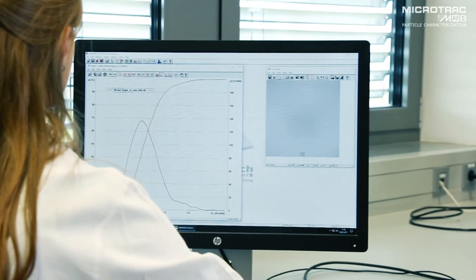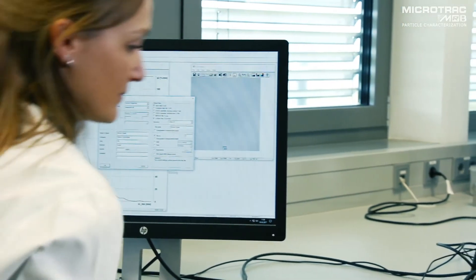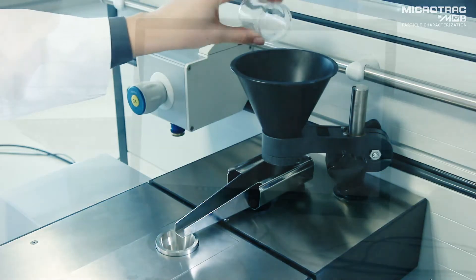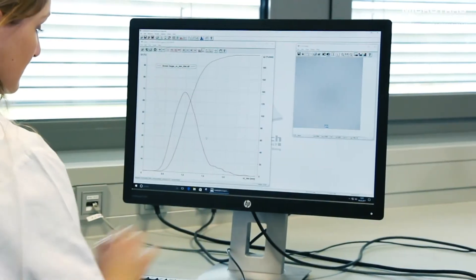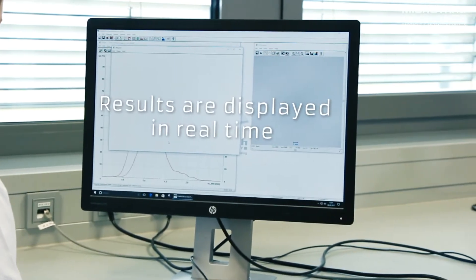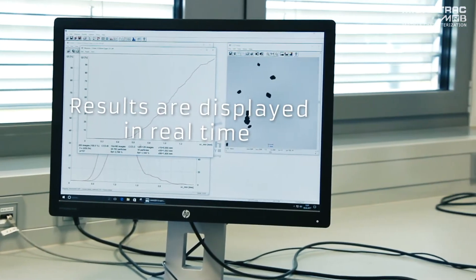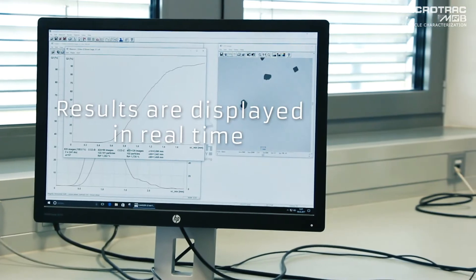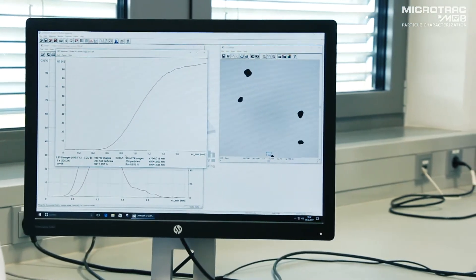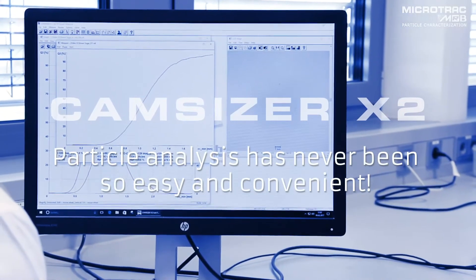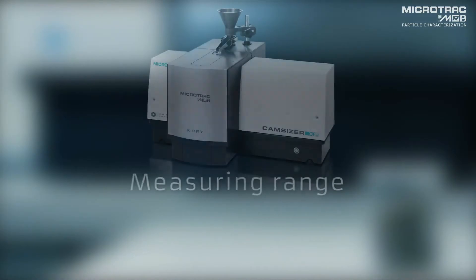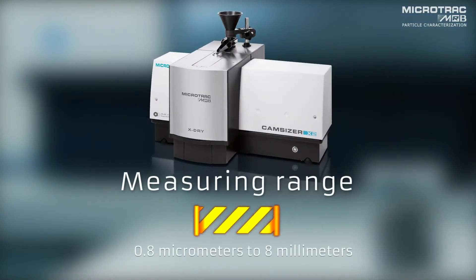All the user needs to do is choose the measurement task, pour the sample into the feed hopper, and start the measurement with a single mouse click. Results can be observed in real time, presented as charts and as live images of the particles. Results are available immediately after the measurement is completed and may be printed as a detailed report — particle analysis has never been so easy and convenient.